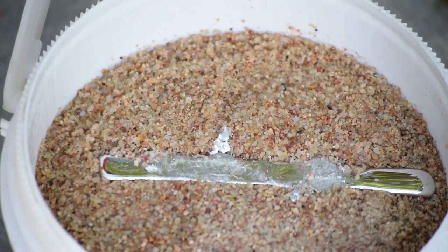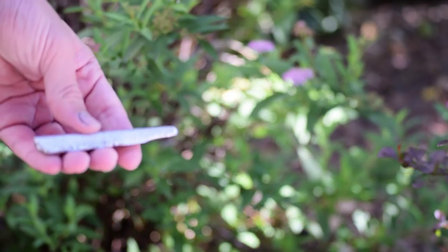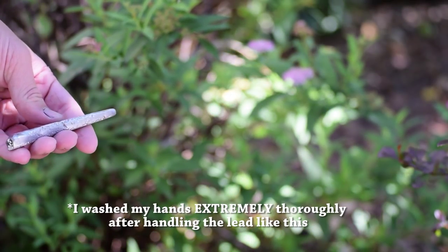The first step is to cast a lead bar. I melted the lead with my blowtorch in a steel pan and cast it in some sand. After cooling, here's what the lead bar looked like.